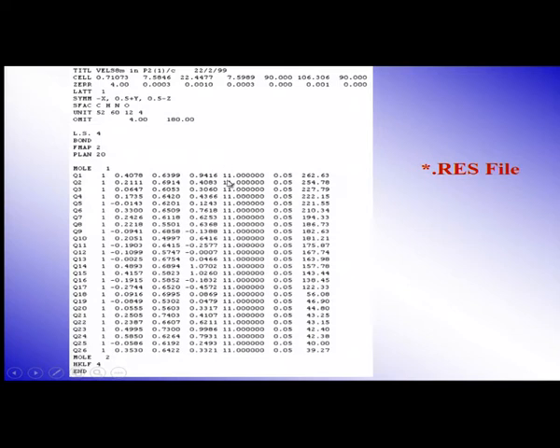In this program, whichever parameter we do not want to adjust or refine from the second stage, you can add 10 with that, which means this is a parameter where I have added 10. So, the actual value was 1, which I do not want to be adjusted. This 1 is nothing but occupancy. Now, an atom may be 60% of the time in one position and 40% of the time occupy another position. If that is the case, for this Q1 we will have 2 positions, one with occupancy 0.6 and another with occupancy 0.4. Total occupancy of each atom when they have 2 positions should not exceed 1.